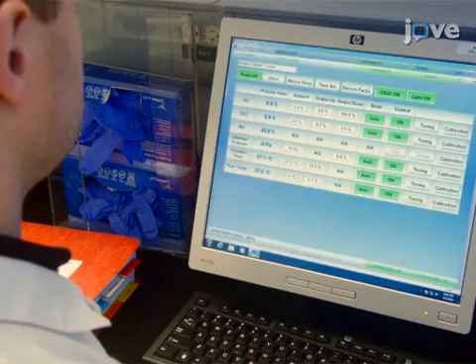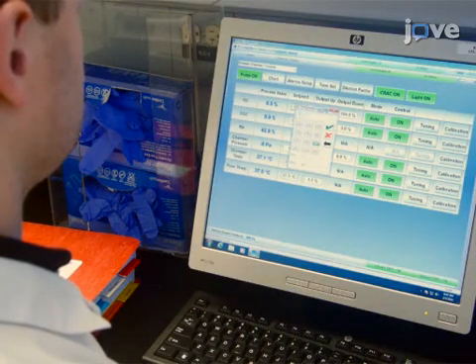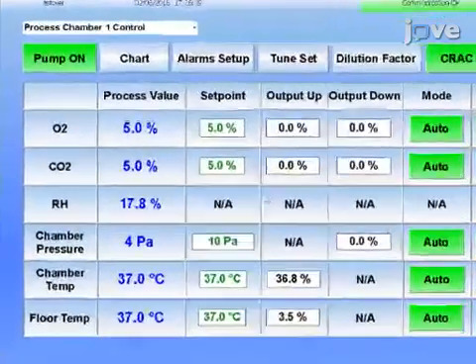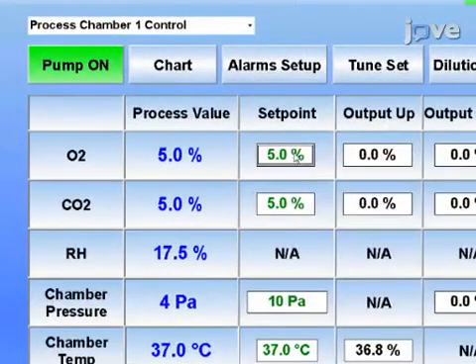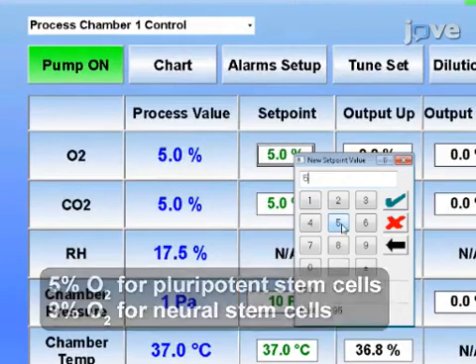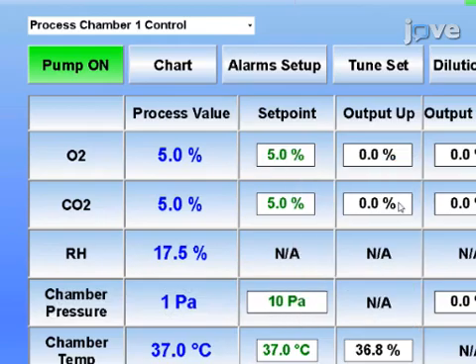To begin this procedure, click on a module to adjust the gas concentration. In the new window displaying the current settings, click on the existing oxygen setpoint value below Setpoint and enter the required oxygen concentration for this module. Next, click on the green checkmark to confirm the setpoint.